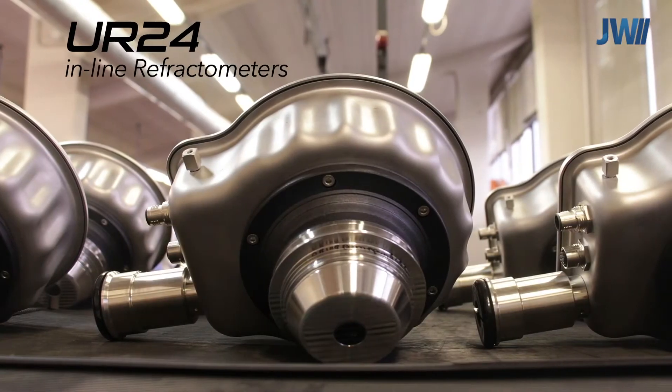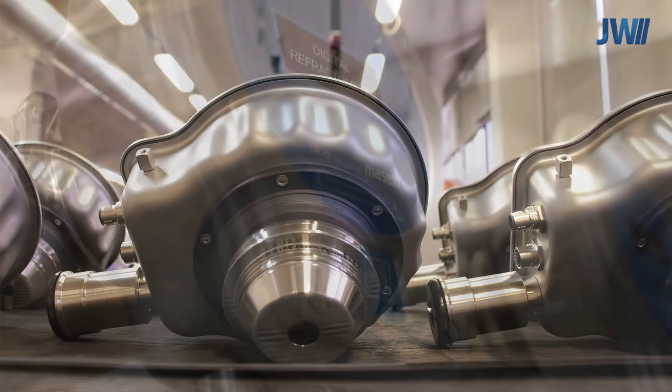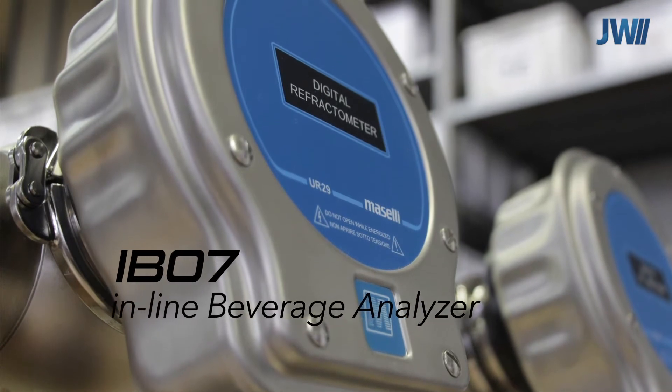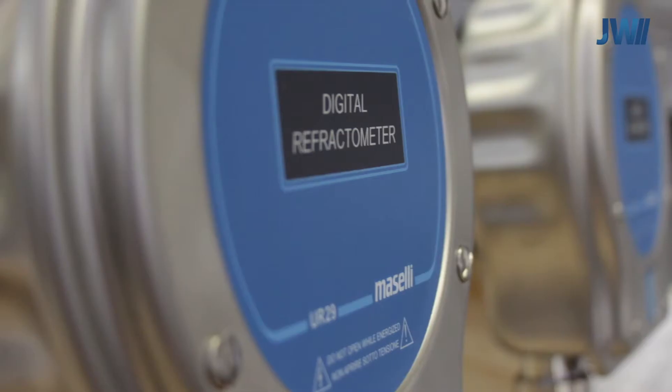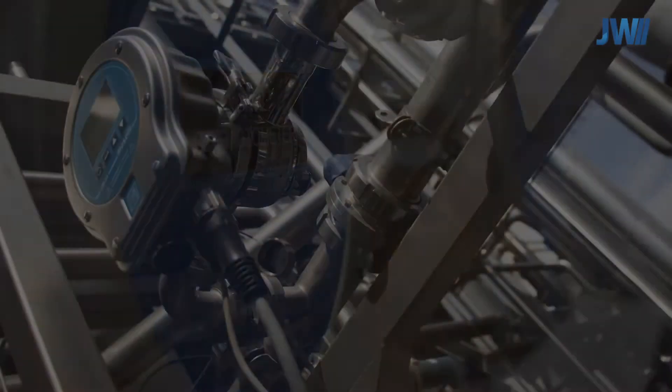Our UR series uses the latest digital technology. This super-accuracy refractometer is used for critical applications in the beverage industry as part of our IB07 system. This sensor can be combined with other analysis modules in the product range.